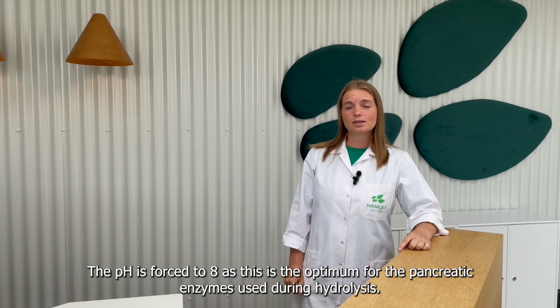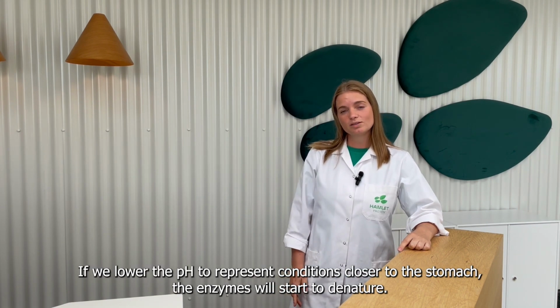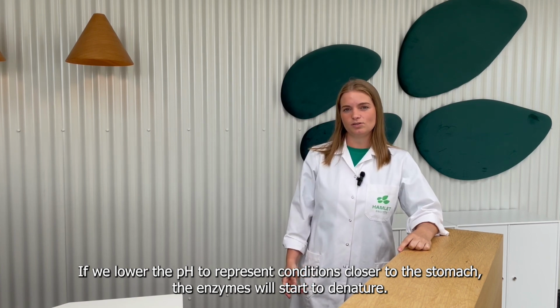We run the pH-stat method at pH 8 because this is the optimum for the pancreatic enzymes used in the protein hydrolysis. If we lower the pH value to represent areas closer to the stomach, this will affect the enzymes because they will start to denature.